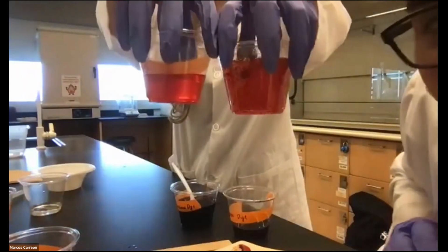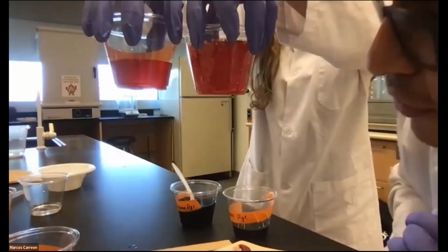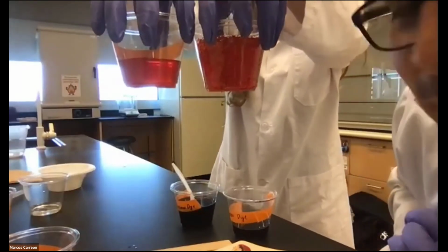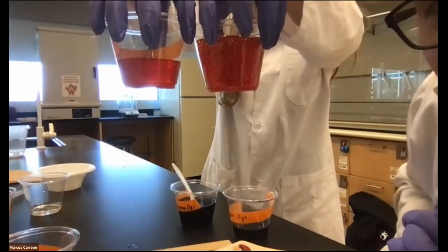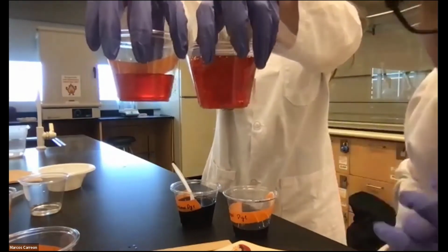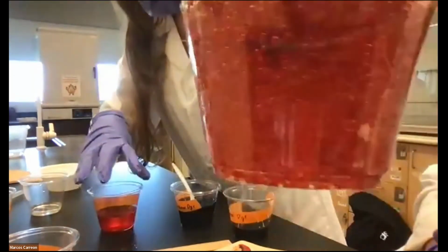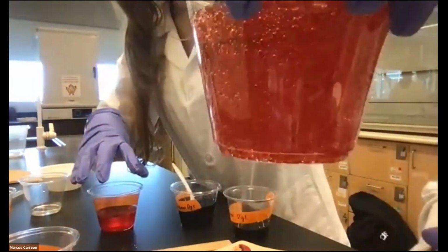Maybe a little bit. We think it got a little bit darker, but I think if we add a little bit more vinegar, or not vinegar, but a little bit more of the baking soda, it'll get darker. But it does look darker, and we do have some fizziness on there.